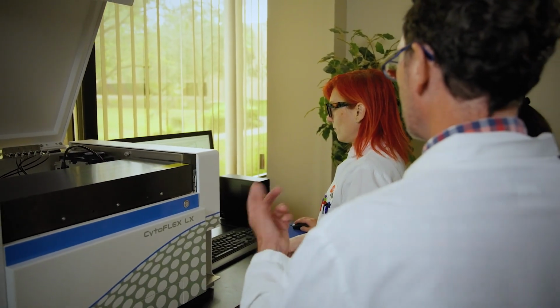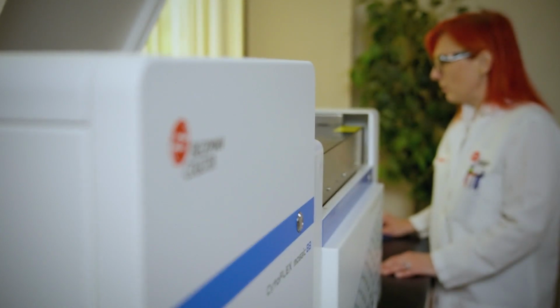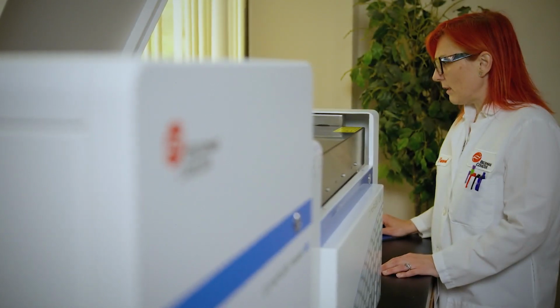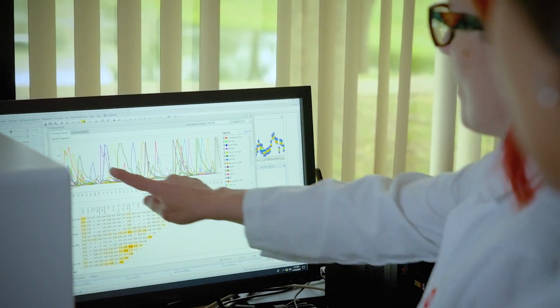Having conventional and spectral flow cytometry so close to one another is also crucial when transitioning to the new technology, allowing you to adopt a new analysis tool with the same ease of use only the CytoFLEX platform can give you. Plus, there are great features that help you visualize and understand the quality of your data. After unmixing, you can see all colors overlaid in one graph along with the complexity matrix. And there are the unmixing checks.